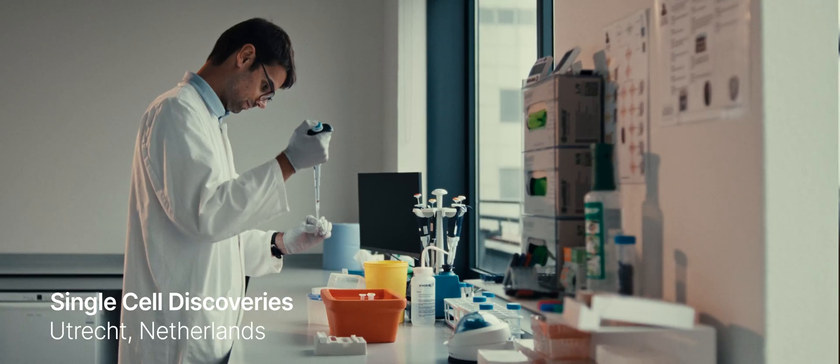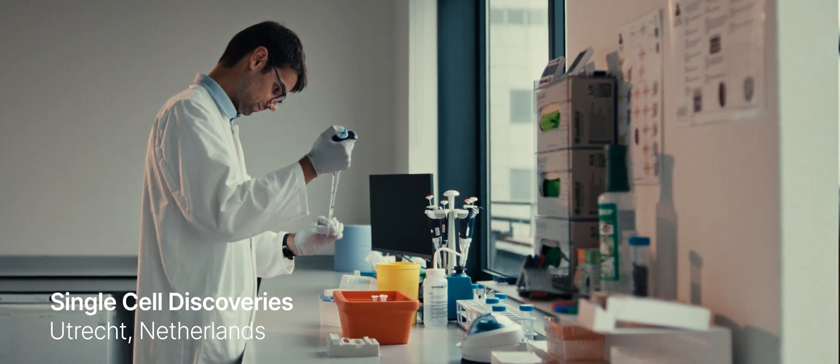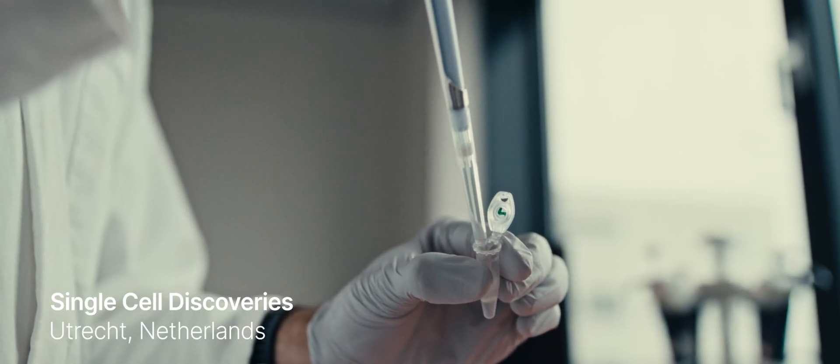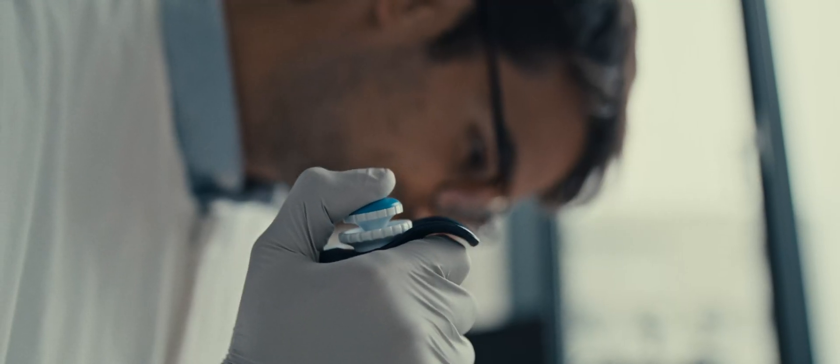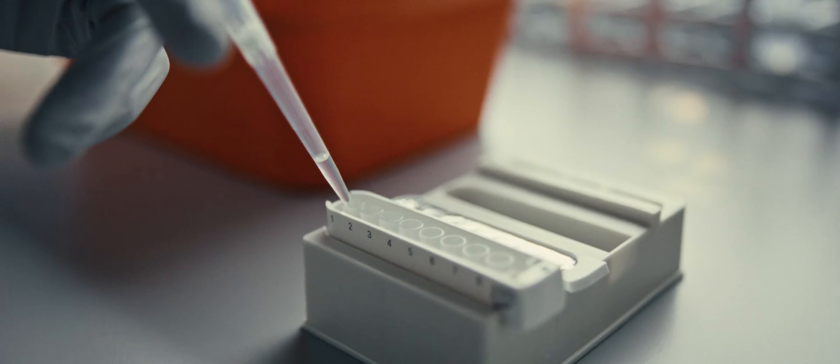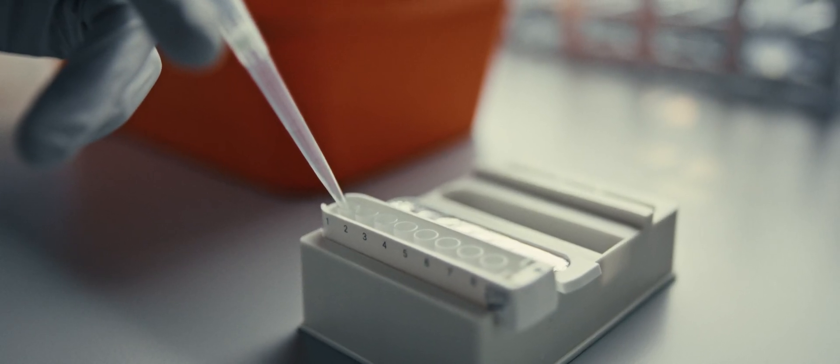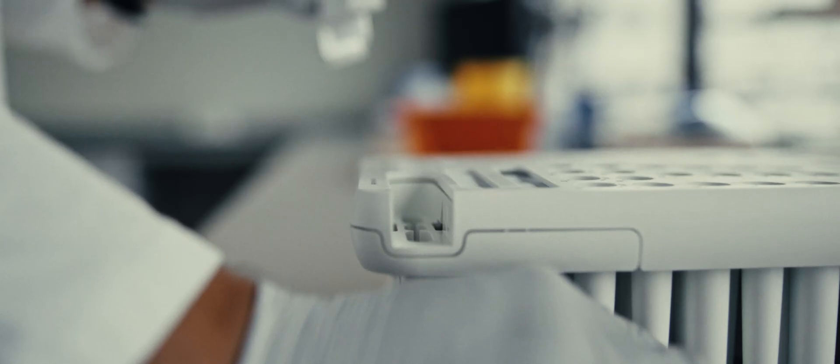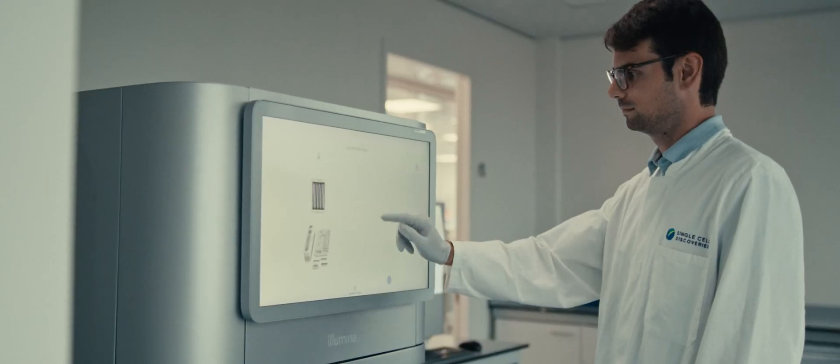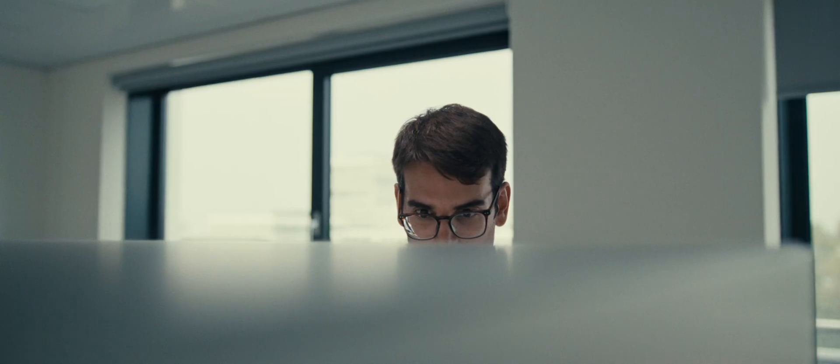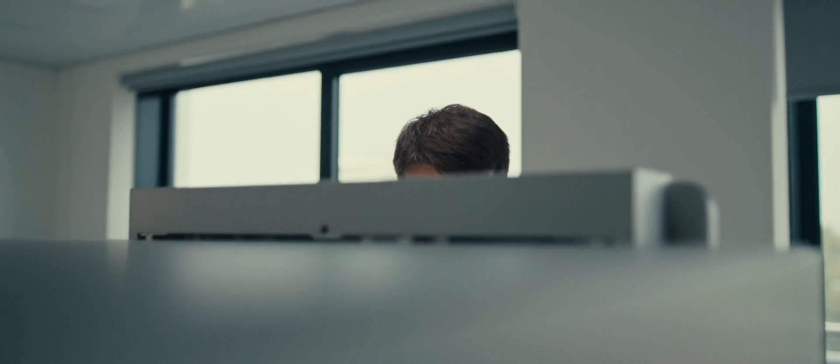The type of experiments that we can now do, that we couldn't do before, is really the large-scale experiments. We're dealing with millions of cells, hundreds of different samples that we're able to sequence in one go. Indeed, on one sequencer, so you have less batch effects, at a lower cost, faster turnaround time.